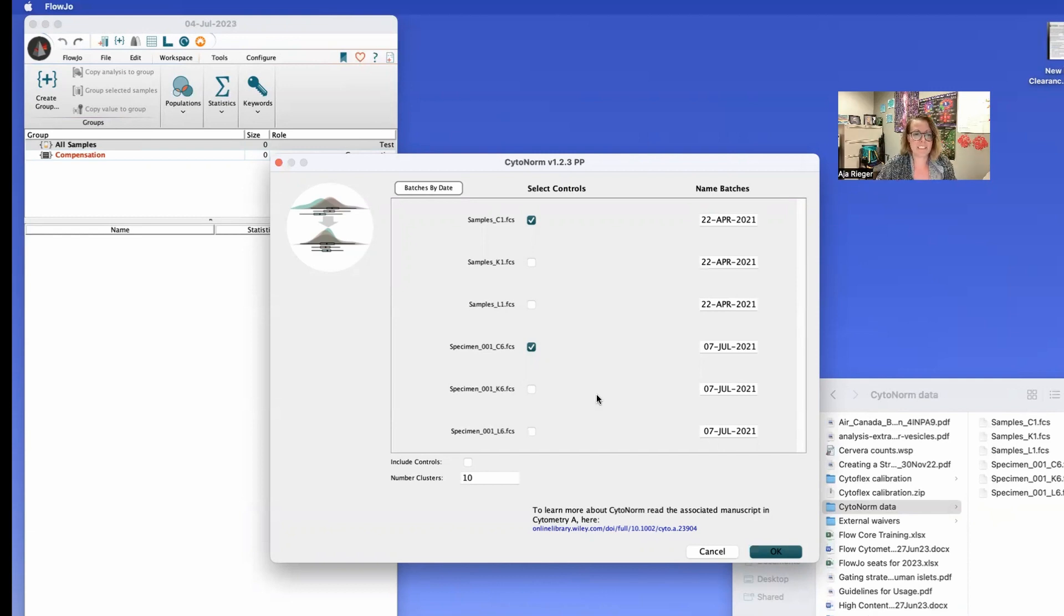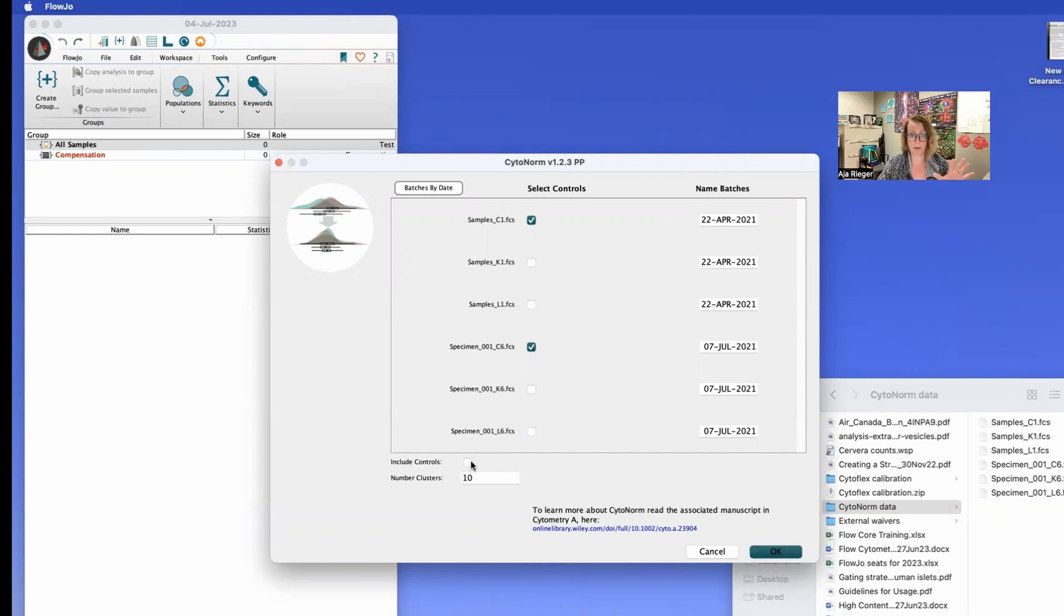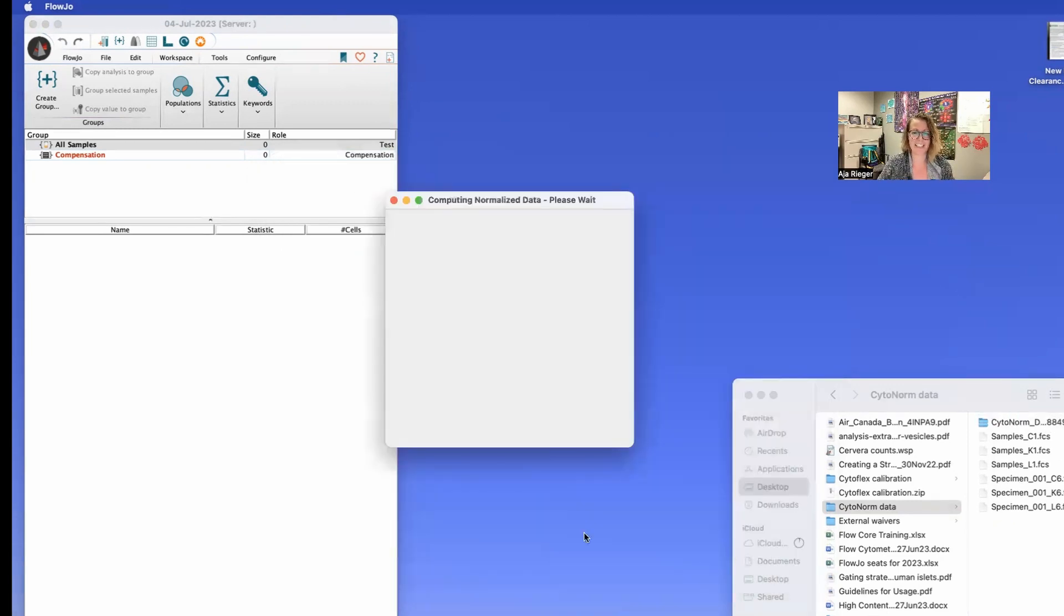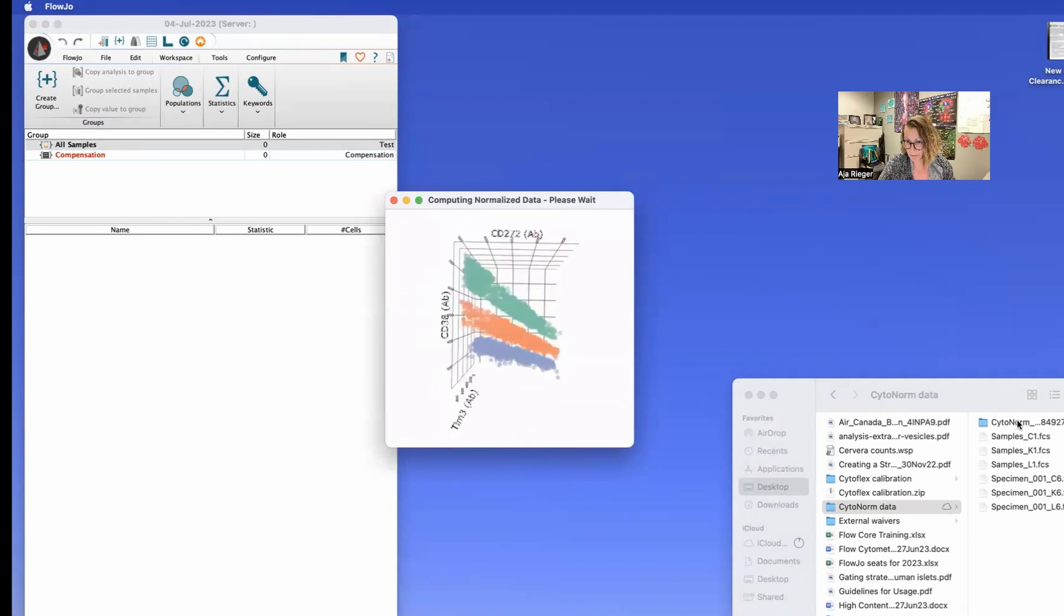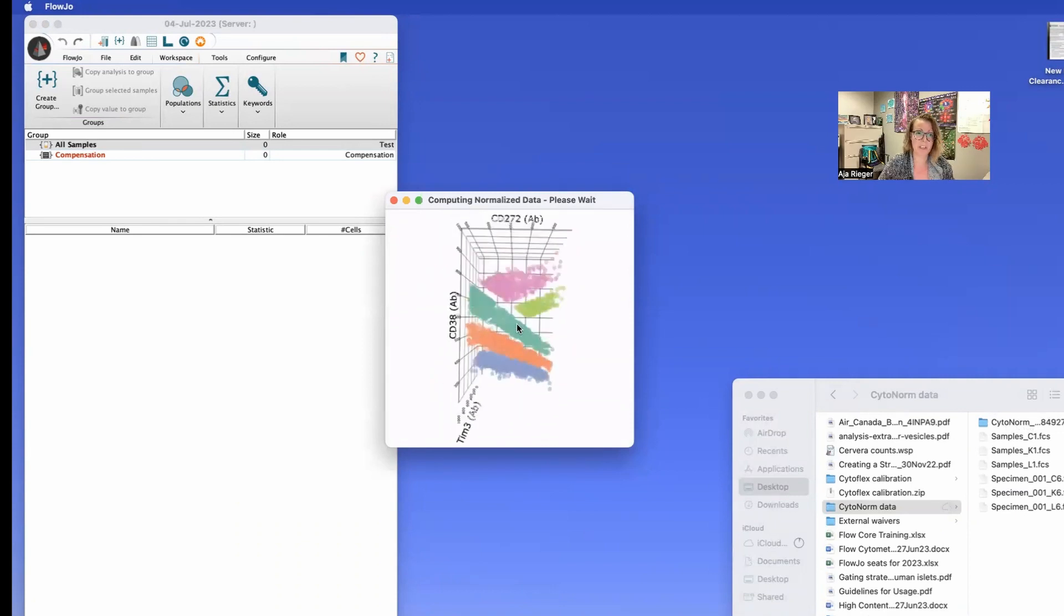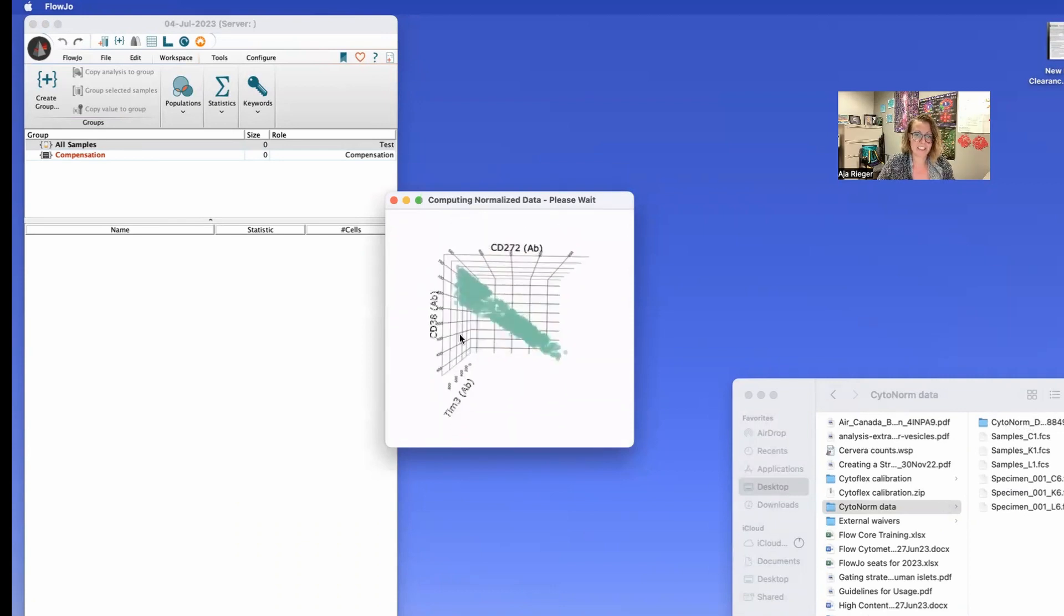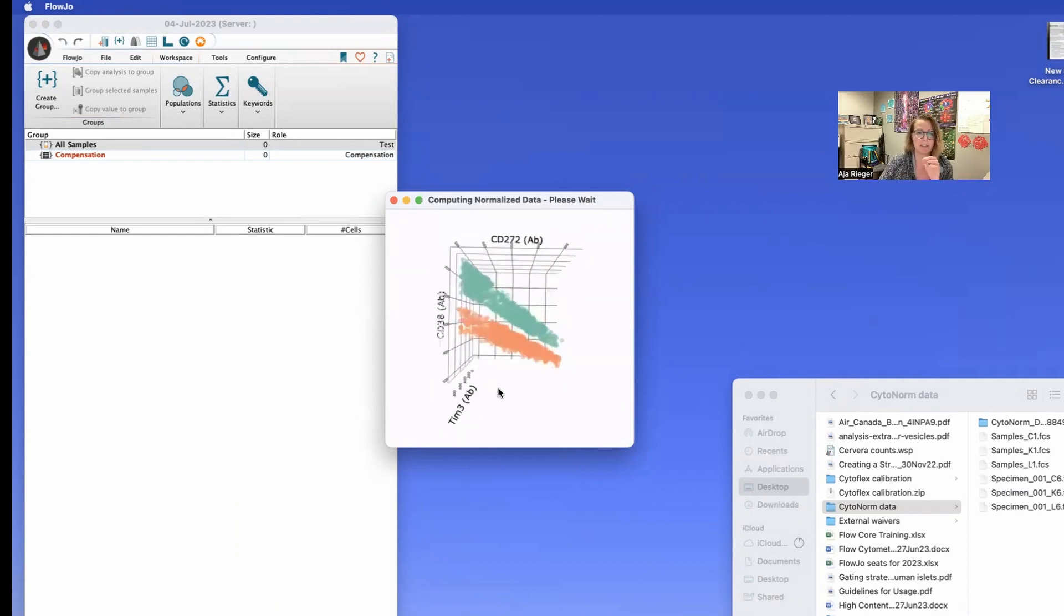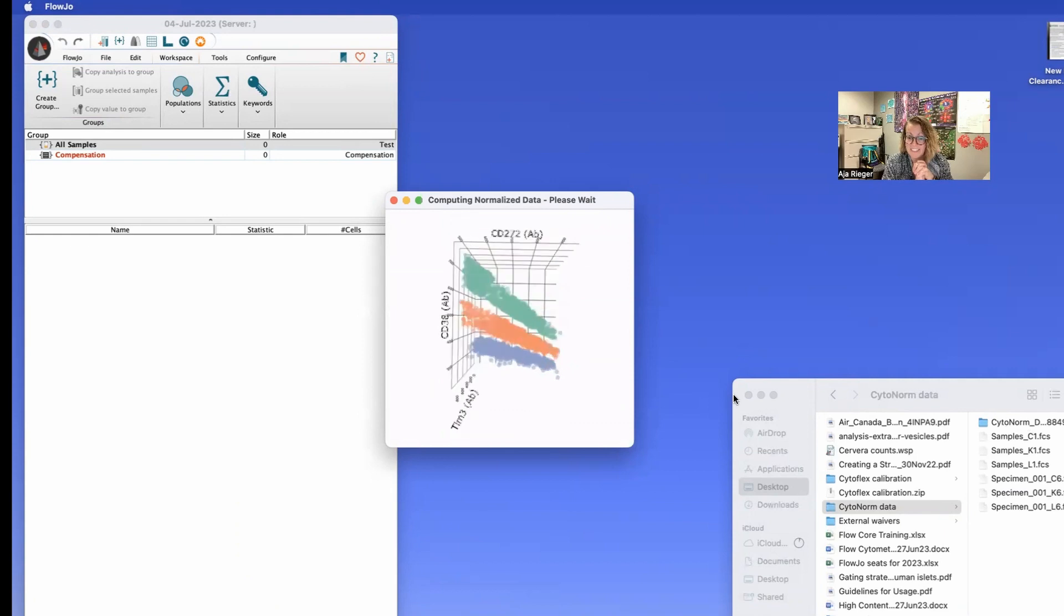Now down here there's this really nice little button that is include controls. This one's kind of neat because it will also then normalize your controls and populate those into your workspace. If you don't check this you will only have your experimental samples and not your controls which will make you sad when you go to do your analysis. So you can check that box you can click OK and it's going to then you'll see this little folder pop up where your Cytonorm data will go and in here you'll see this happy little box going through doing your analysis.